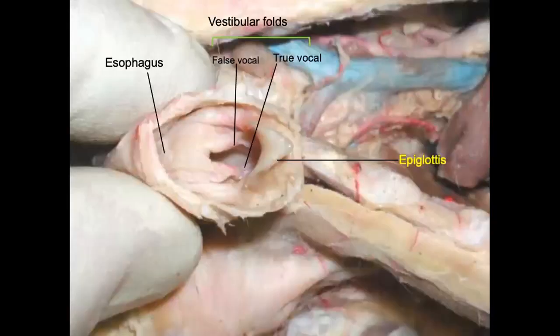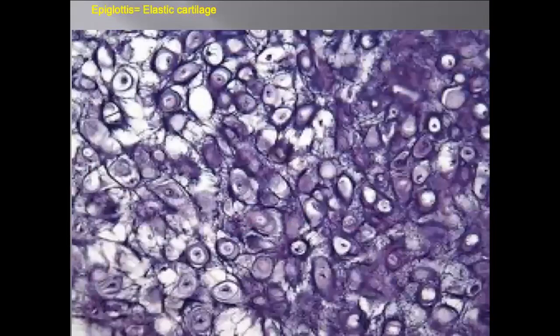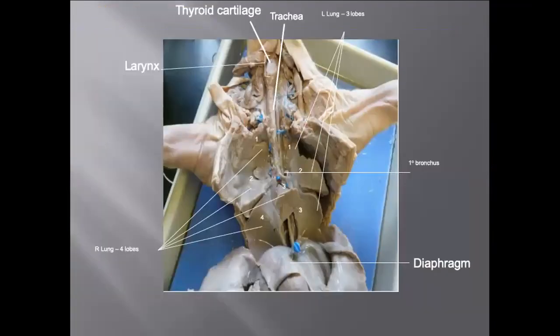All right, so we've talked about this. There's a very disgusting look once again. Probably want to ask this question this way. It's just an interesting angle. That again is elastic cartilage. And I don't plan on showing a whole lot of tissue pictures, but if I run out of questions to ask, I will do this. So throw back to Anatomy 1.